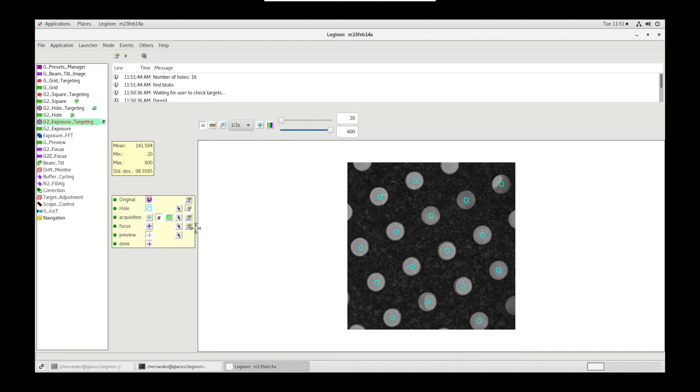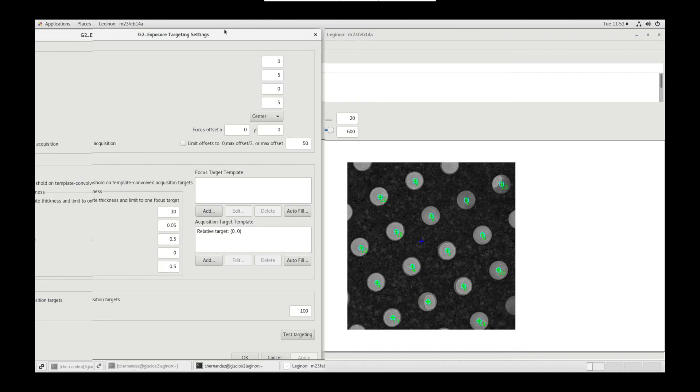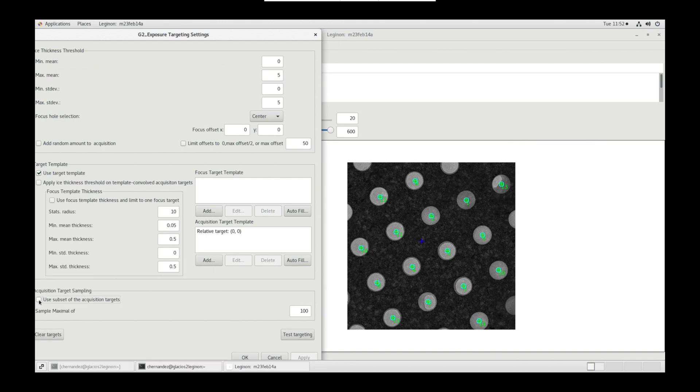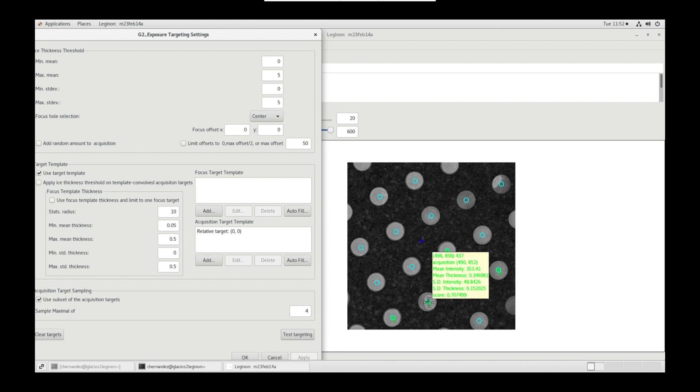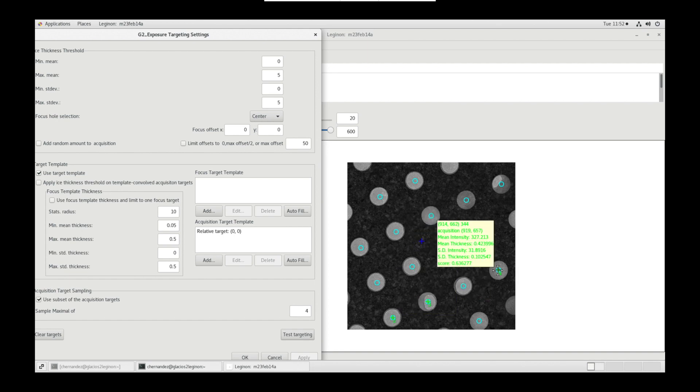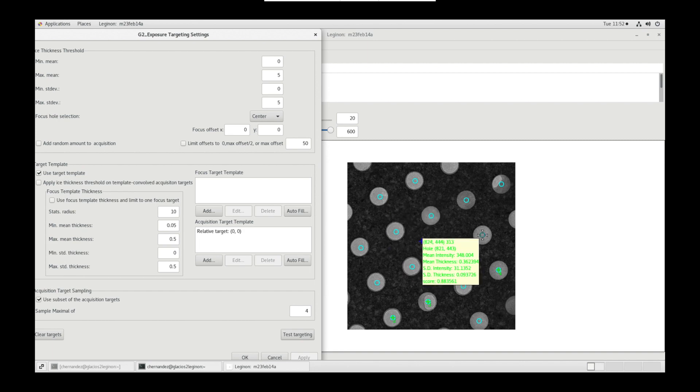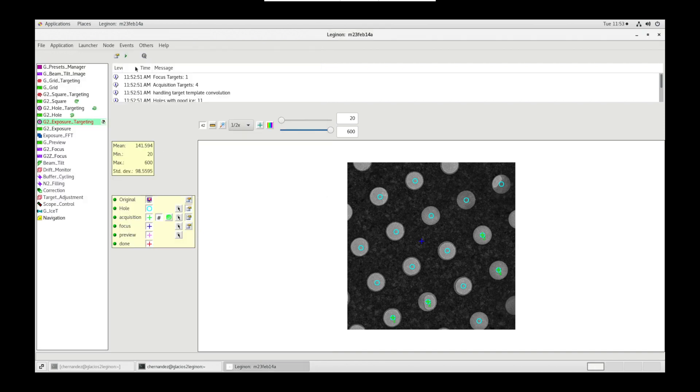The algorithm will calculate the lattice of holes. In acquisition settings, under acquisition target sampling, toggle use subset of the acquisition targets. For screening, I sample 4. You can note the mean thickness and SD thickness values to threshold out two thick and two thin holes in ice thickness threshold. Again, be wary, as these values may change grid to grid, so wider range would be favorable. Click OK and submit targets.